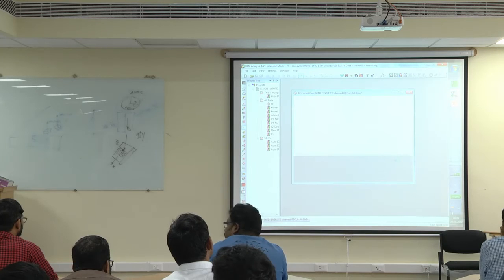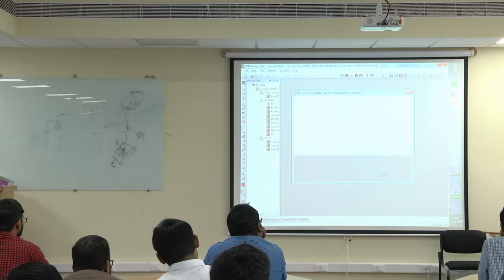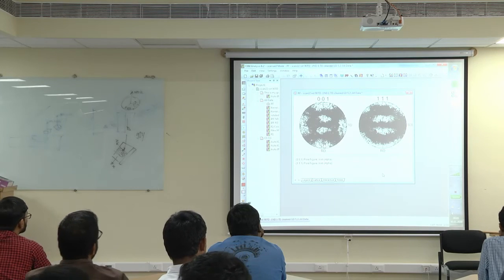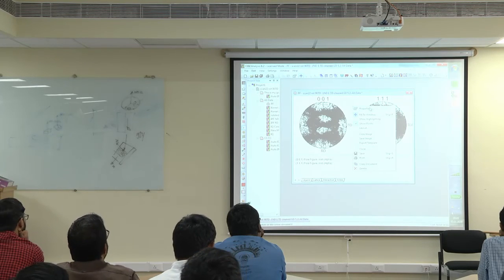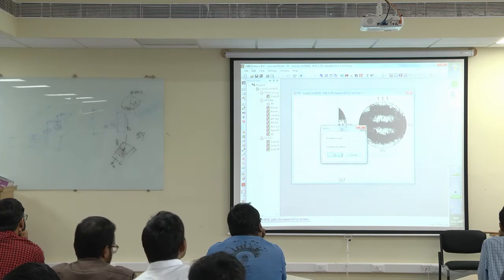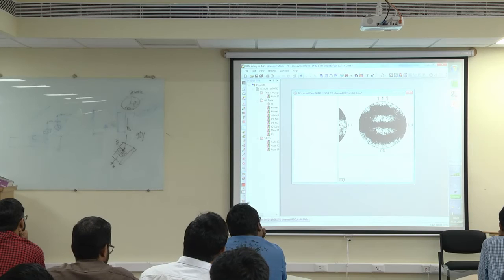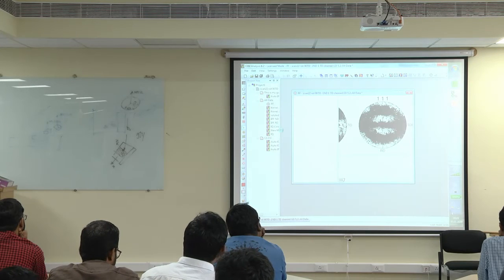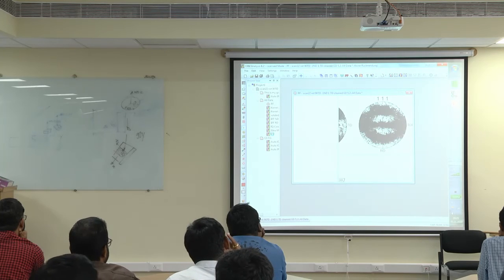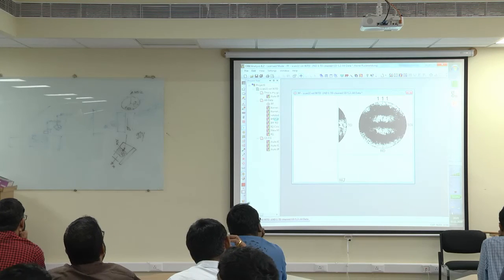Okay, and soon we will stop with the exercises here. I hope it's working now, yeah, this is working. I don't know why that other thing did not. Again, do the layout changing to 1, okay. And plot the IQ. No, plot the inverse pole figure ND, yes, it's better.